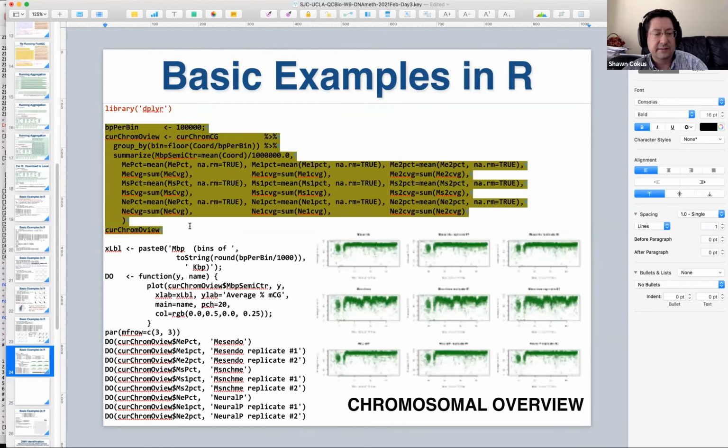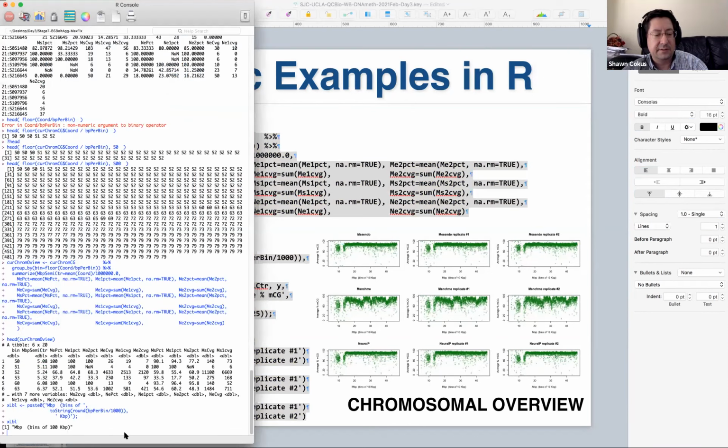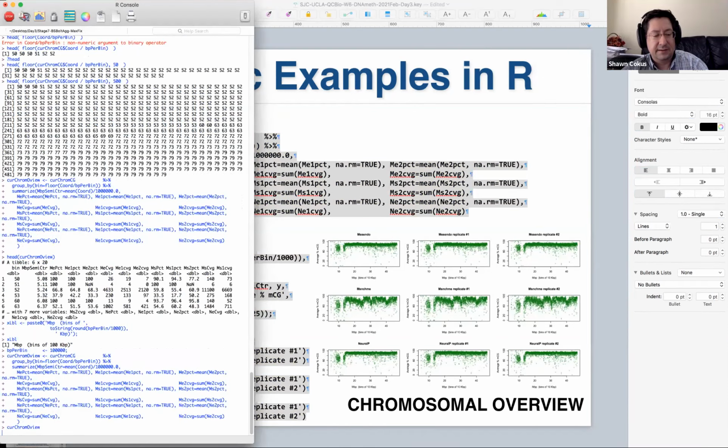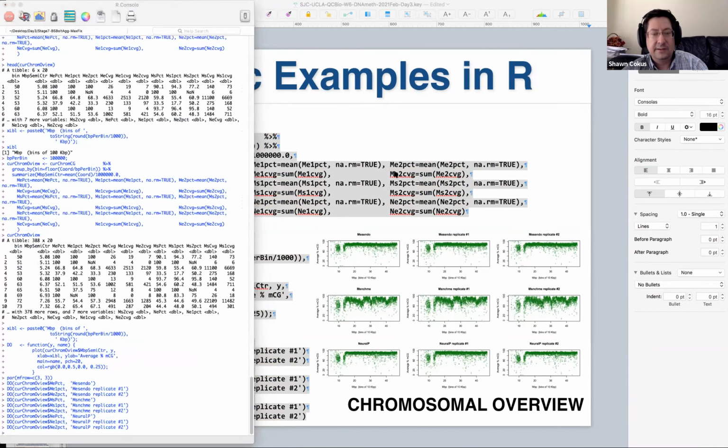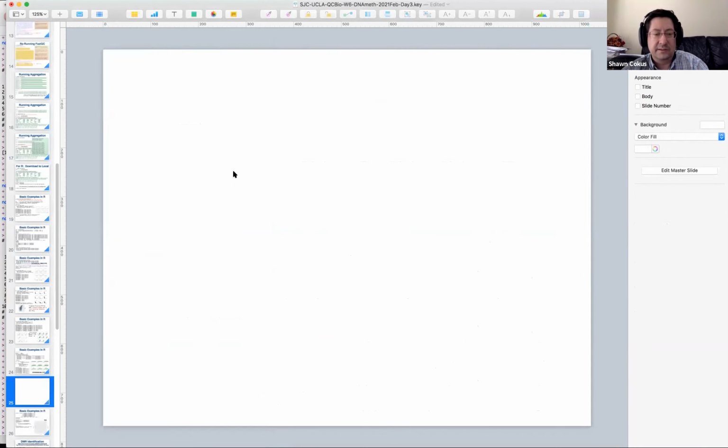And paste all this. There we go. I don't want it square; I like it wider to fit the screen. There we go. Just copy that. I'm going to paste it into the right window so you can see it.